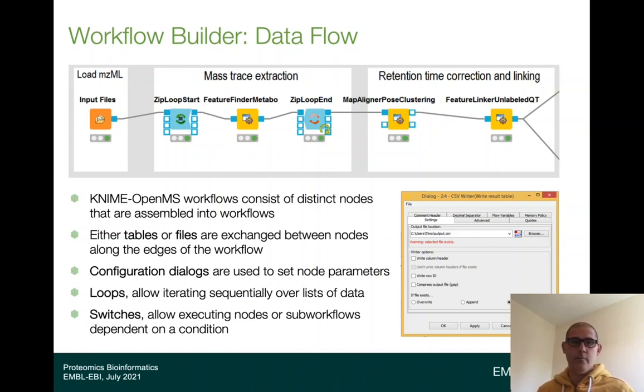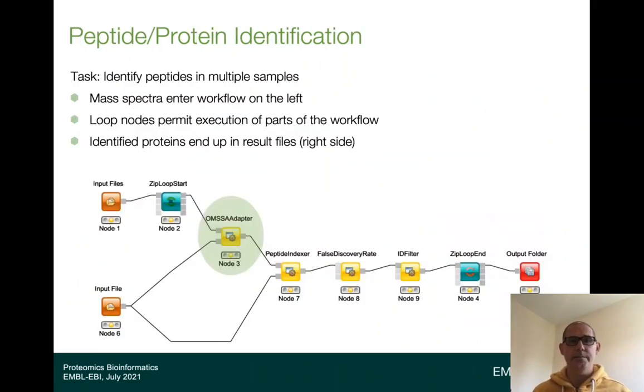This enables the user to perform really nice experiments, whereas in a monolithic tool you basically put in your data and get some results after that. But in monolithic tools, only one software is used for protein identification, one software for feature detection, and one software for protein inference and so on. In these particular workflows, you can replace, for example, the tool that performs the protein inference with another tool, which gives you more flexibility and more power over your data.